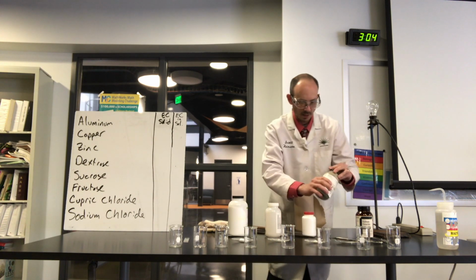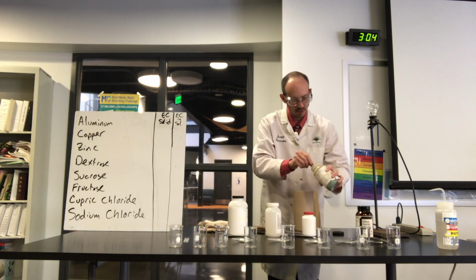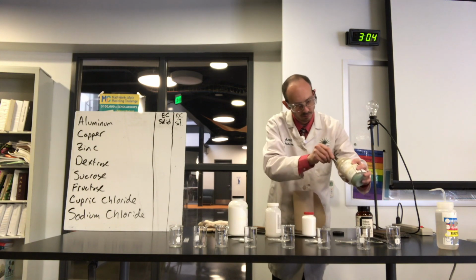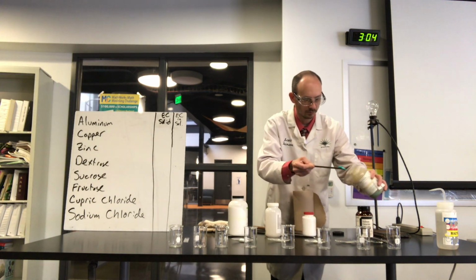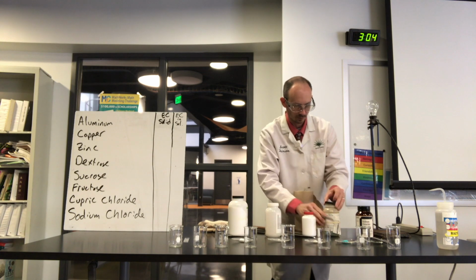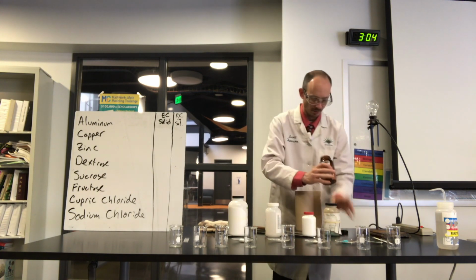Okay. And then we got some copper chloride here. All right. And then last but not least, sodium chloride.